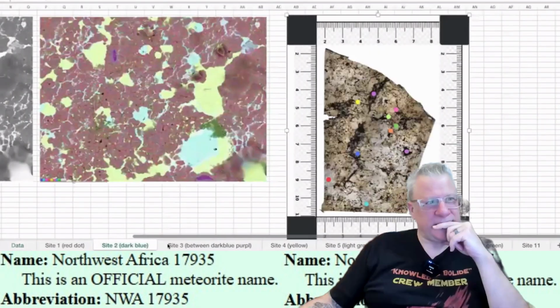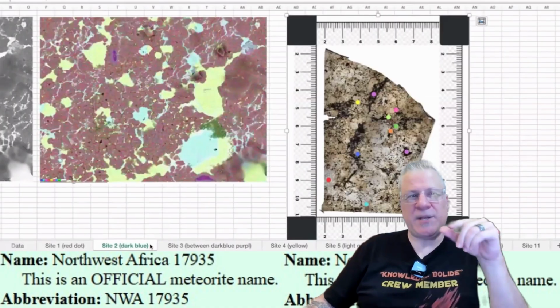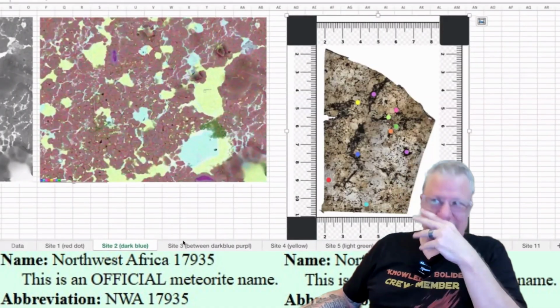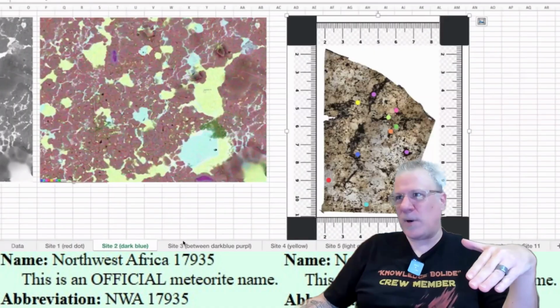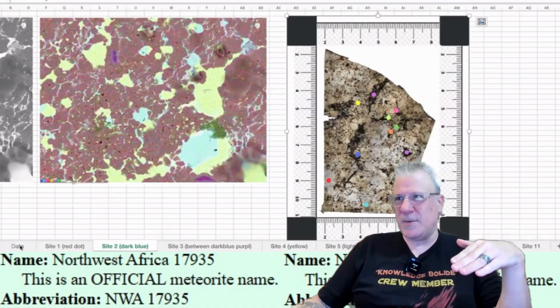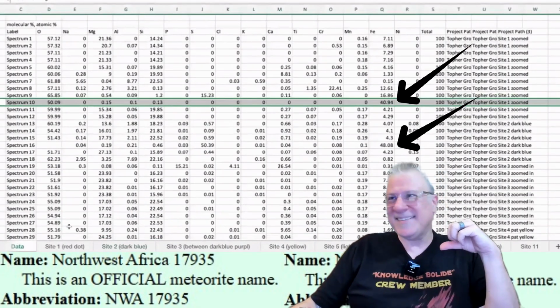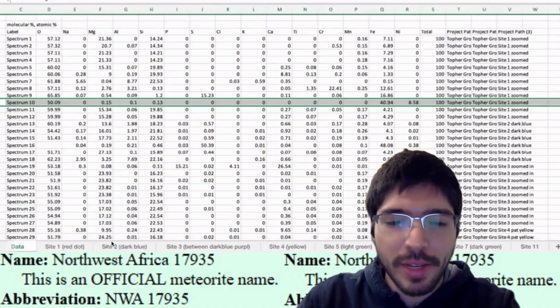That's amazing. Sorry, go ahead, Topher. No, I'm just saying that's really amazing and very cool that we can do that. I want to pay attention because on like the eighth row down, there's one with the nickel and iron in the 40s where it's nowhere else. So I want to see where that one was taken. Yes, yes, okay, we'll get to it. Absolutely. I'll be patient.